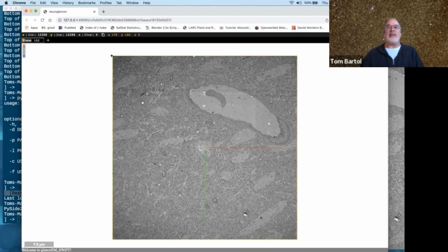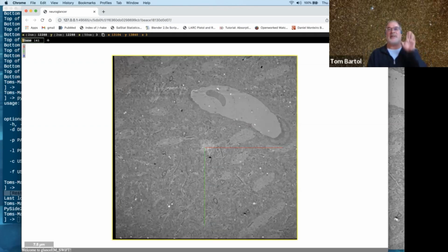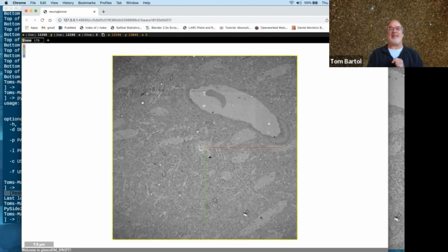And the order of data in the file is, this is the first pixel in the file. And this is the next pixel, next pixel, next pixel. You get all the way to the end of this row. And the next data is the next row from top to bottom. So that's the order of the data in the image, right? And then the Z dimension is going inward into the page, I think. This is the first image, the second image, third image, fourth image going into the page. Maybe it comes out of the page. I don't know, but it's got some order.